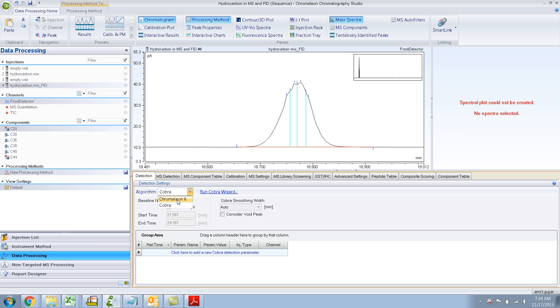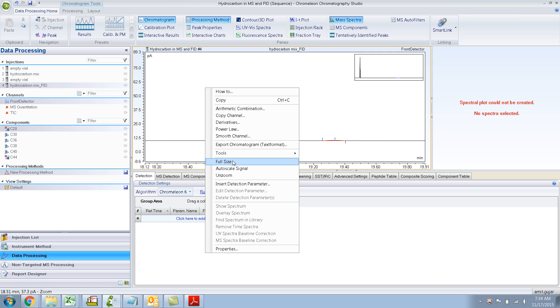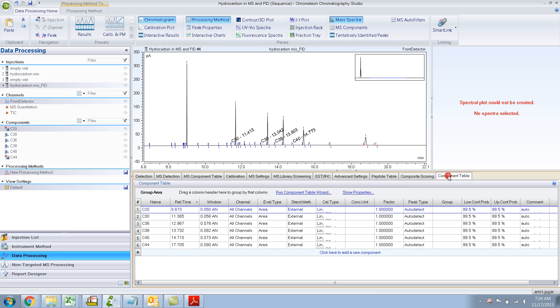For now let's choose Chromeleon 6 because it has integrated pretty well. Let me zoom out - right click, unzoom, just unzoom. Unzoom means it takes one step backward to before you zoomed in. Now let's fill our component table. This is the same processing method. So now if you fill the component table with the right retention times - the retention time has shifted a bit from the MS detection channels, from the second injection.